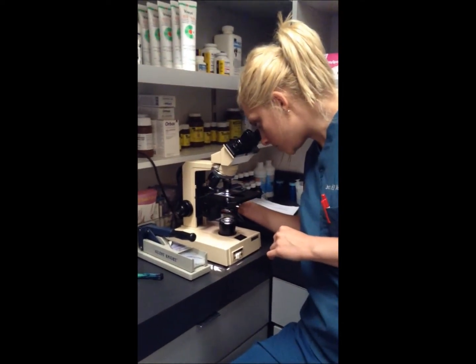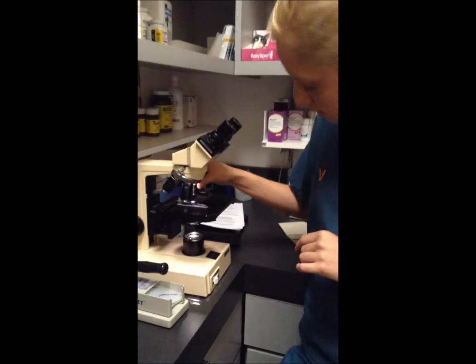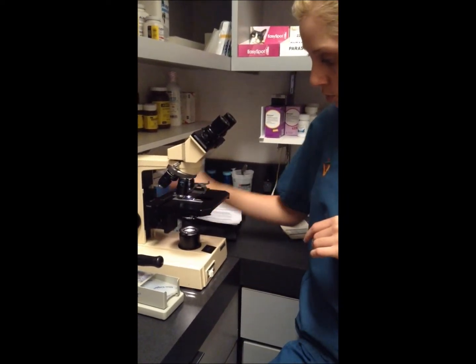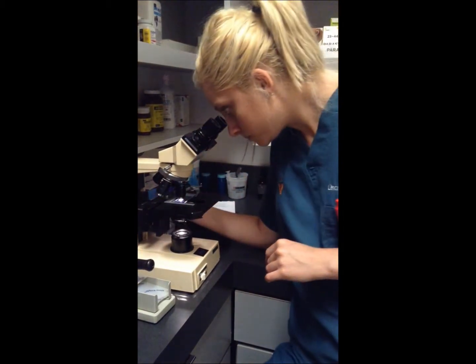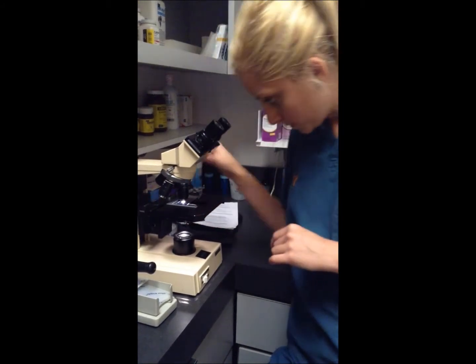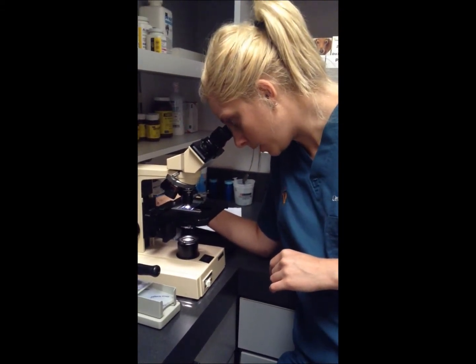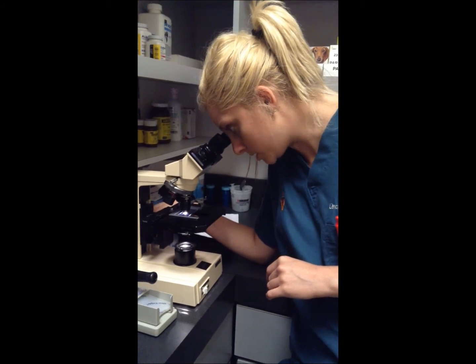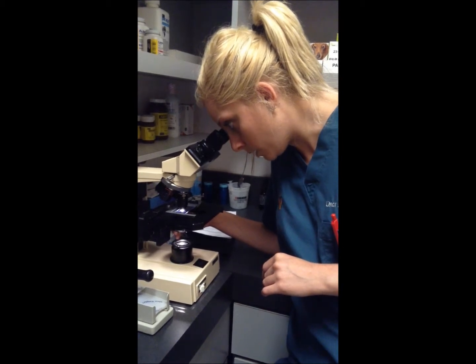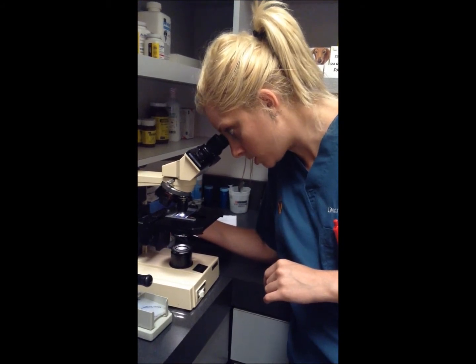And the dial to focus is over here on the right. And then we're going to place some oil on the slide. Doesn't really matter how much you put on, usually like 1 or 2 drops. And you count basically per high power field how many of each you may see, whether it's bacteria or yeast, and you let the doctor know. So they know basically how bad the infection is, and they can place the patient on the proper medication.